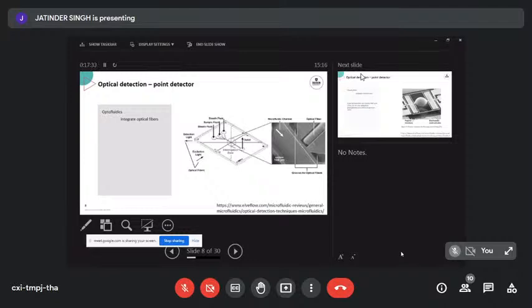And what they've done here very cleverly is they, in addition to their microfluidic channel, made 2 additional microchannels. And those microchannels were exactly the size of the outside of an optical fiber. Then they got someone with really good eyesight and really stable hands, and they got them to poke an optical fiber into a channel the size of a hair, because optical fibers are also about 200 micron. Can be done. So a very patient PhD student here poked an optical fiber into a microfabricated structure to end up only microns away from the channel where they want to do the optical measurements.